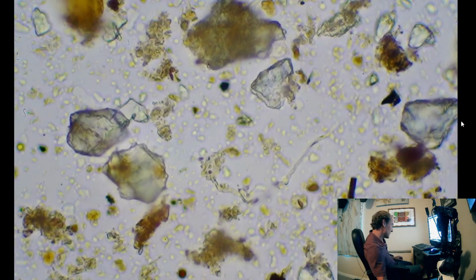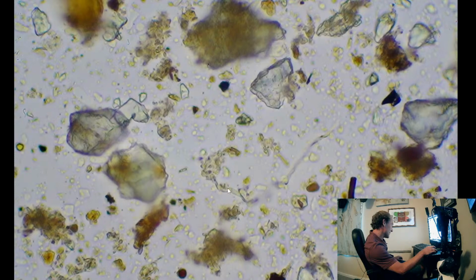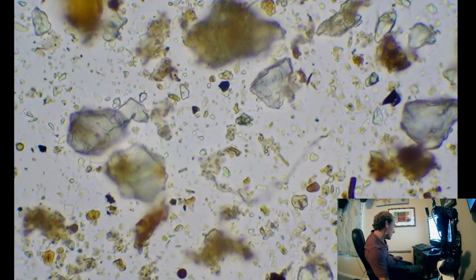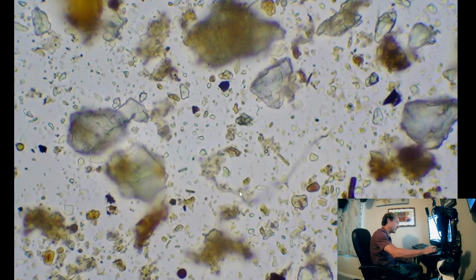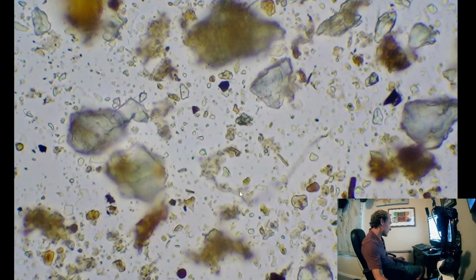But since we don't see any separations in the cell walls, like that's... can I get a little bit? Nope, that's just the shadow from this piece on top of it. So it's really helpful to go in and out of focus to tell that sort of thing.